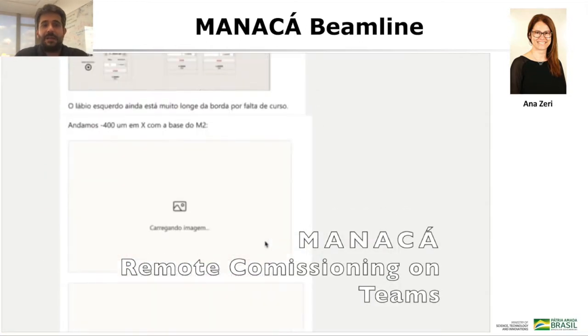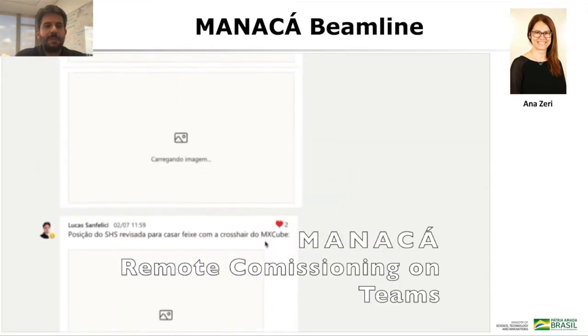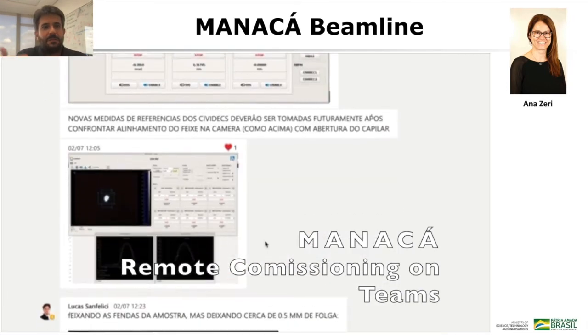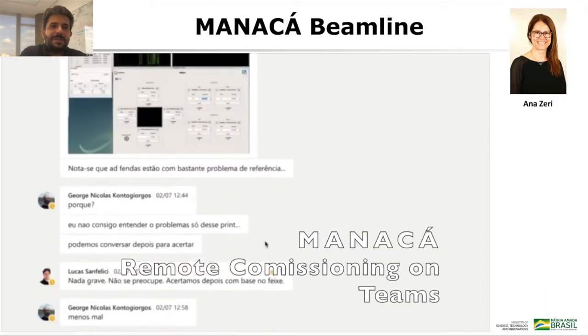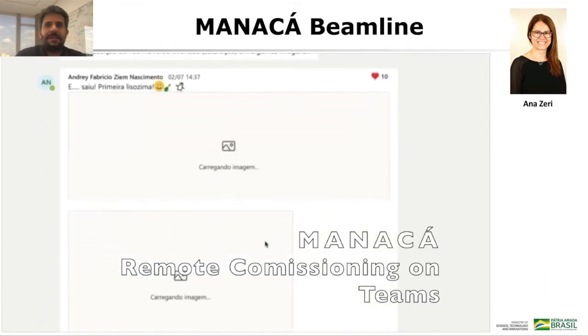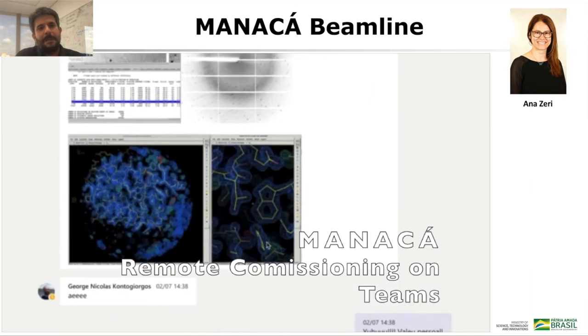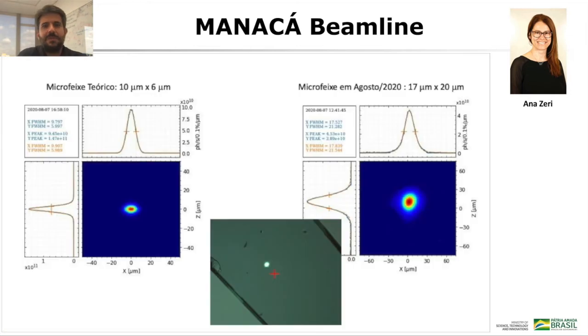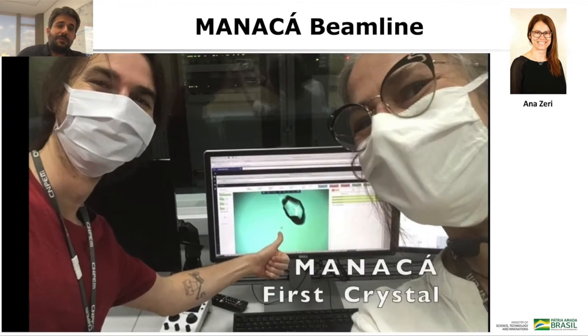I think it's the first time it was done in a synchrotron. So most of the people, the employees, were at home and connected with a couple of people here on site. And it was a very exciting way of doing commissioning. We could tell that the results were coming up and people were cheering from their homes and accessing instruments. And we could even bring the beamline up to speed for the first measurements.